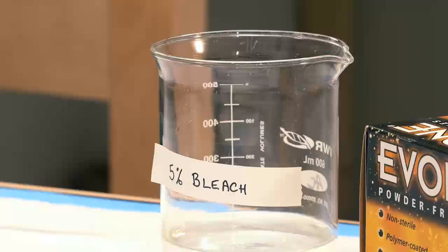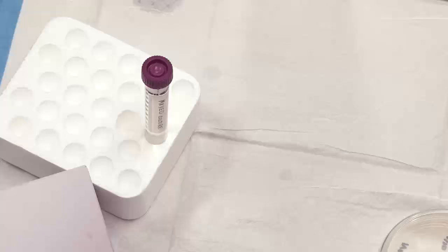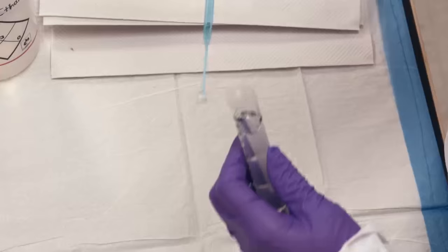Dispose of contaminated tools, such as inoculating loops and cotton swabs, in designated waste containers. Keep cultures in test tube racks. Do not try to lean them on things.